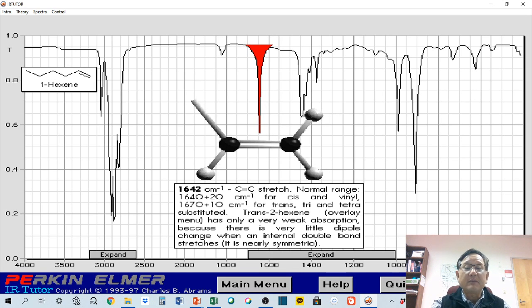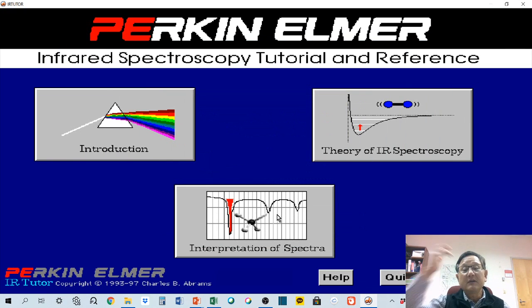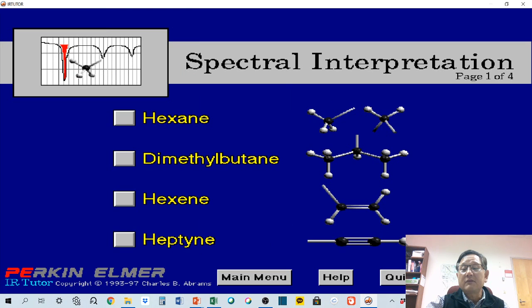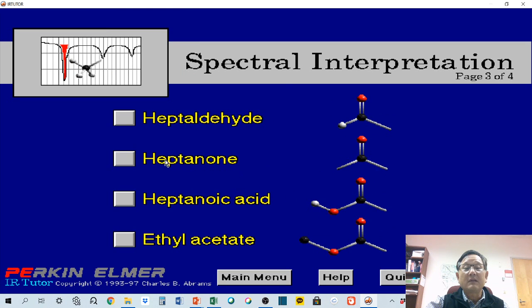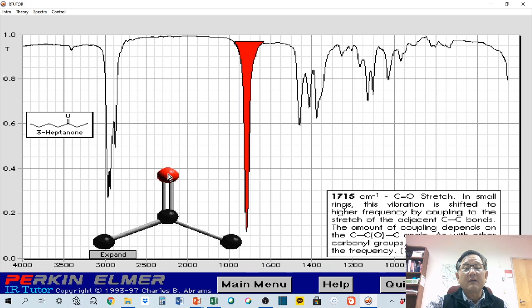This IR spectroscopy allows us to understand the motion of molecules. This software was provided by Perkin Elmer IR tutor. I talked about the 1700 peak, and that has something to do with the motion in what's called the ketone. This is a carbon and an oxygen double bond. There is a strong peak here, which represents a carbonyl peak, C=O double bond stretch. This is what you've seen in the adhesive. Some of them have 1700, some do not. This has something to do with distinct vibrational spectrum around the carbon ketone.